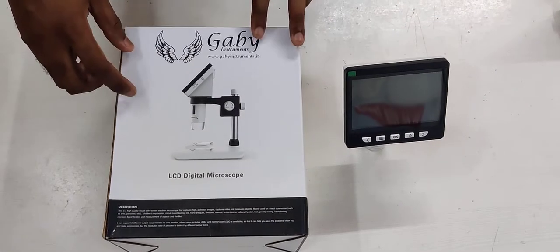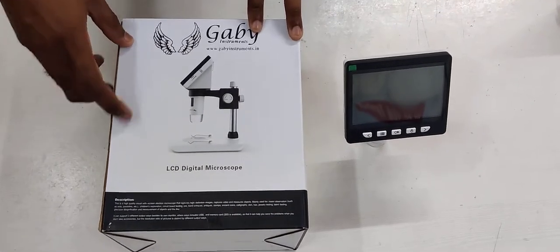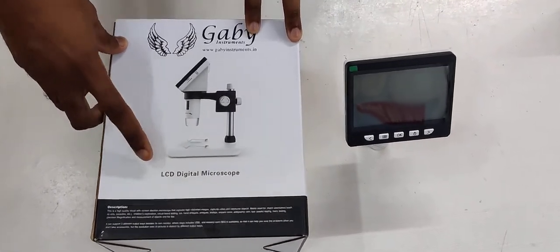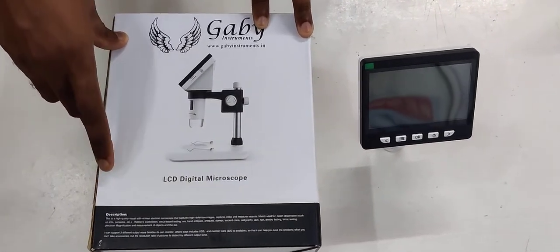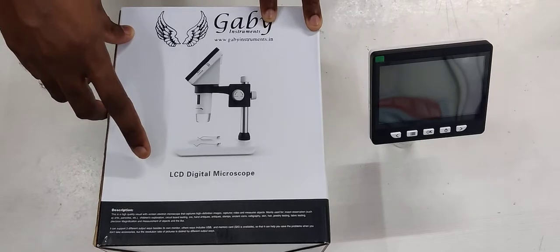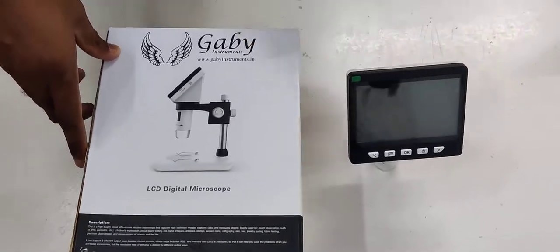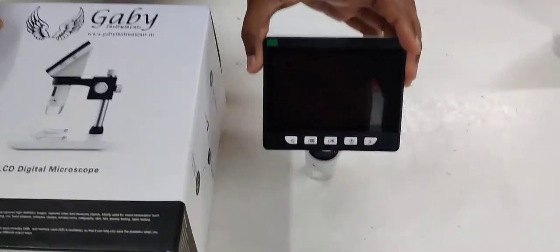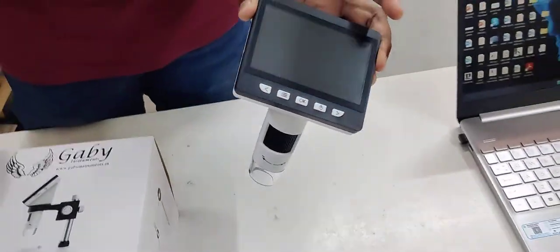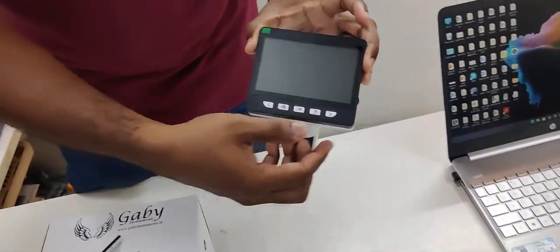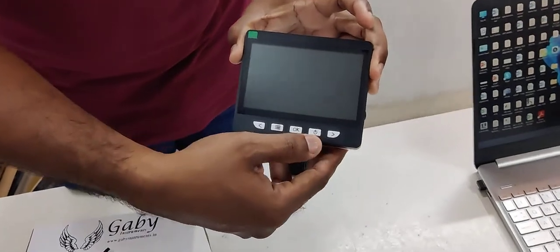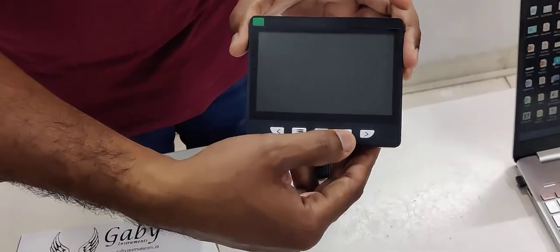Gabi Instruments introduces the new LCD digital microscope specially for fabric. This is a microscope specially for fabric. I will explain you how to use it.